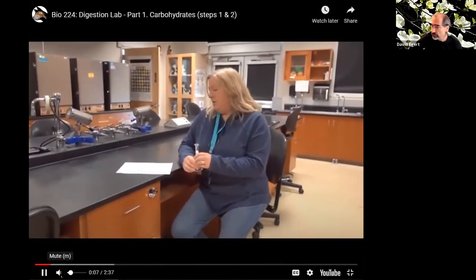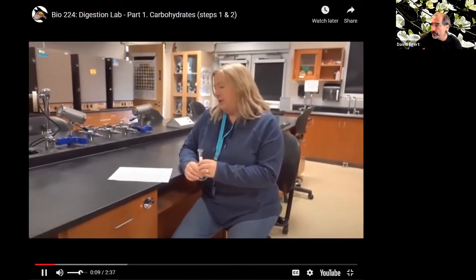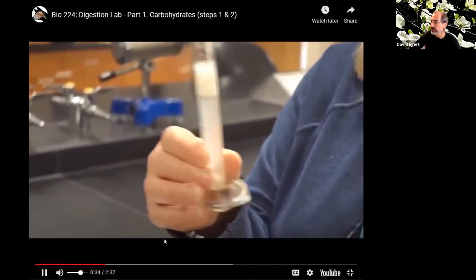Okay, we're going to be going over part 1, salivary digestion of carbohydrates. The enzyme we're using for this part of the digestive lab is salivary amylase, and the source of that is our saliva. It says to collect 7 mL of your own saliva in a graduated cylinder. I have close to 8.5, almost 9 mL, collected in my little spittoon graduated cylinder.